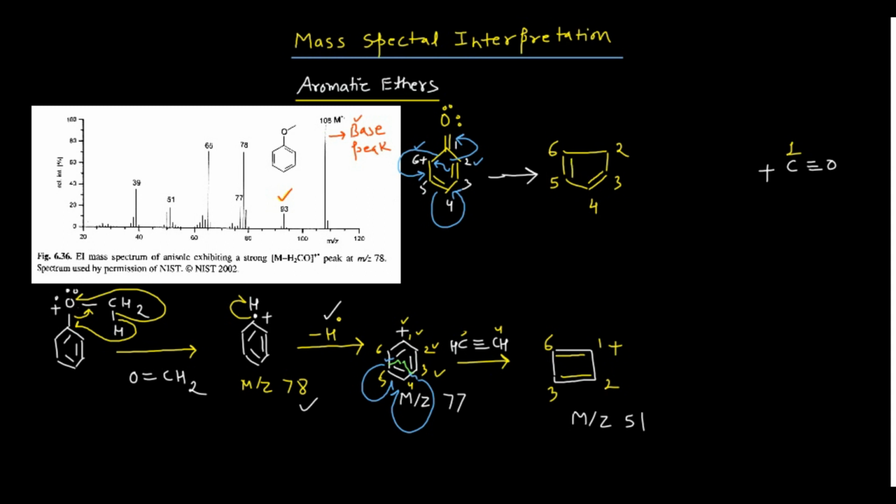And you know, now this electron pair has moved from here to here. That means carbon 2 is now electron deficient, and this electron deficiency will be shown by the positive charge. You are having these fragments. So this is actually your m/z value, which corresponds to 65.